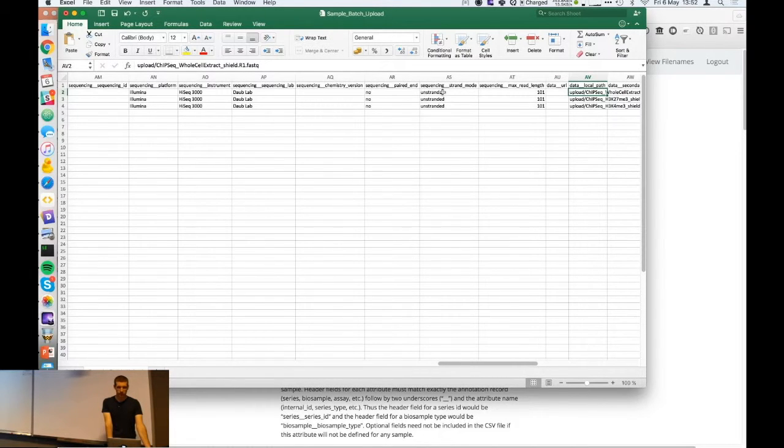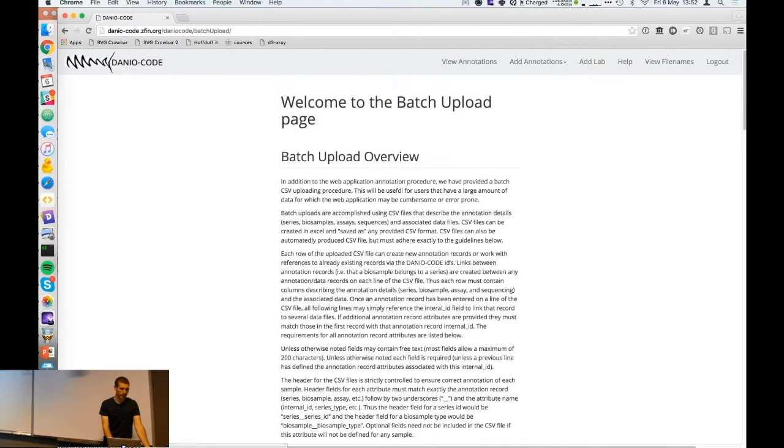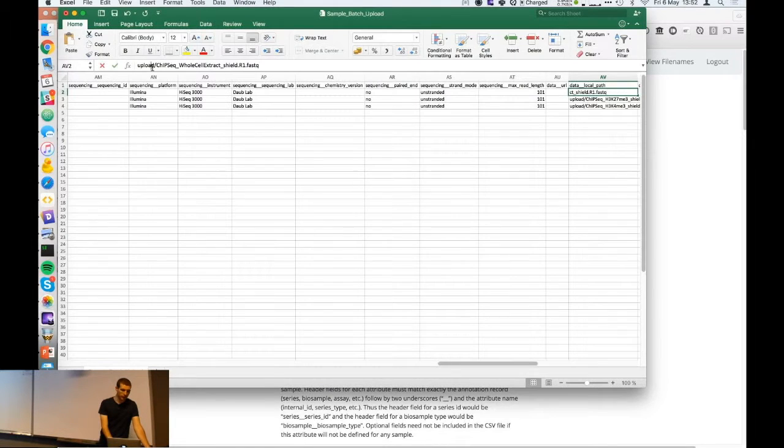Just now we are in the data section, where I can either specify a URL path to the file or the local path on our CVIN server, which, as mentioned before, you can find in the View File Names link up here. So the file name, as before, has to be the parent folder name, so the name of your lab folder, and then the exact destination to it.